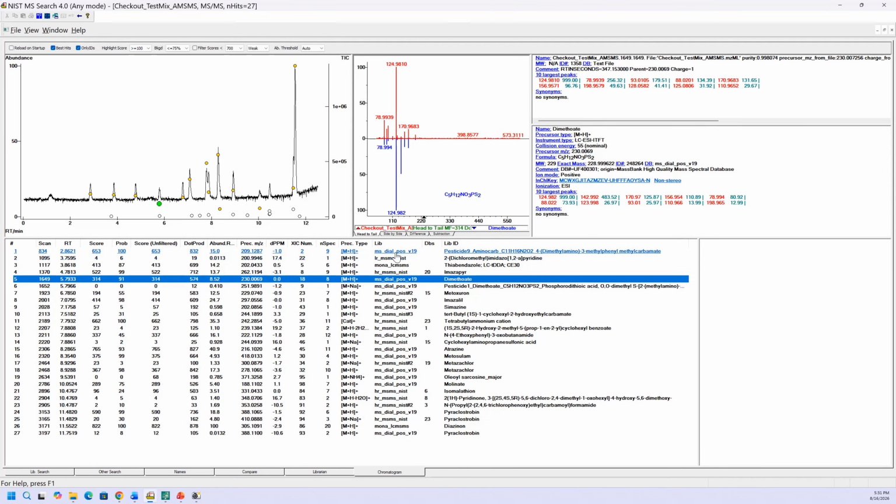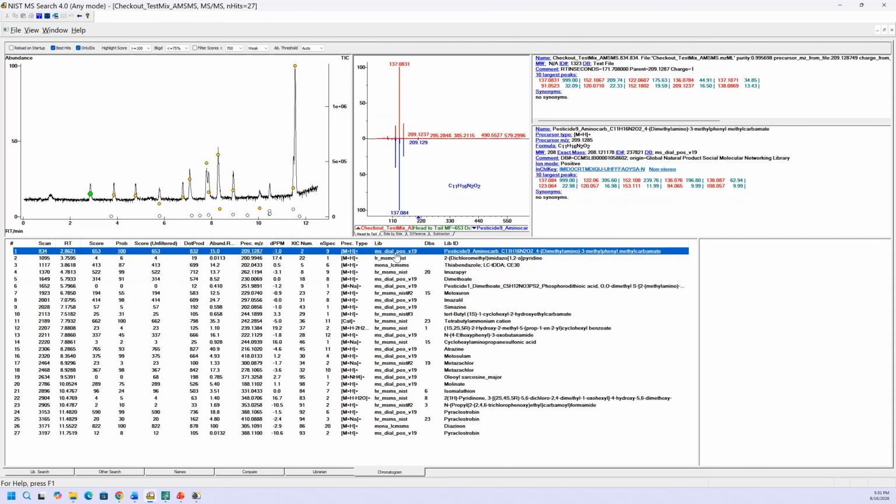One thing is, you can see the libraries over here, and a lot of the libraries, I told you, do not have structures. So that's somewhat of a downside when you mix these two libraries together. So you have to decide if that's worthwhile in your work. If you only had the free libraries and you're doing a demo copy, it's definitely worthwhile. But here, you'll have to decide.